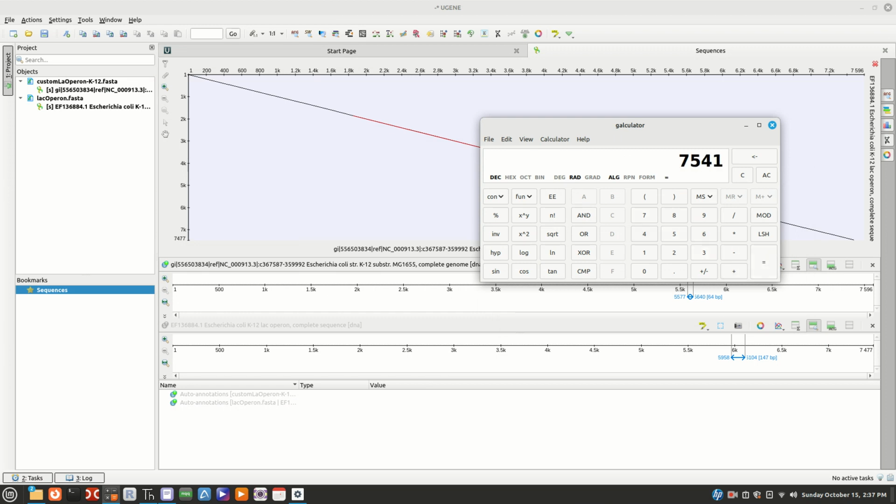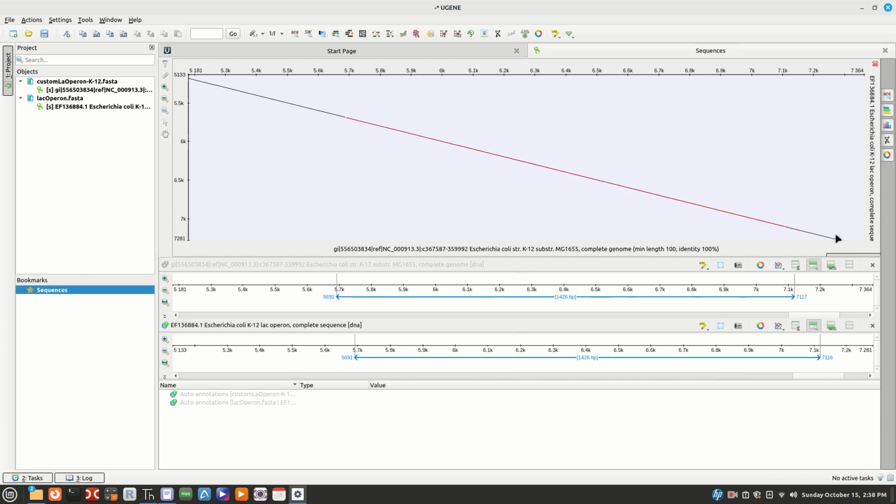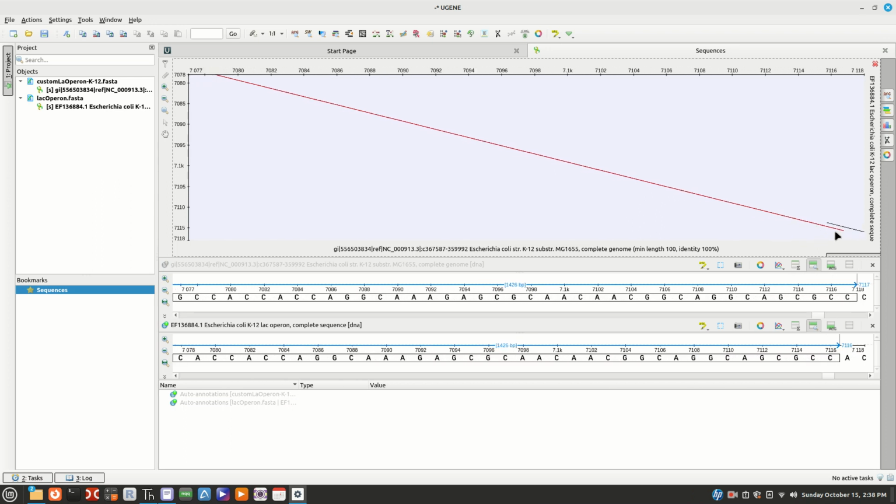That would make, no, still doesn't make up enough. There might be more than one break. So that is interesting. Oh, and here it looks like there might be another break. Oh, there's some overlap. Interesting.